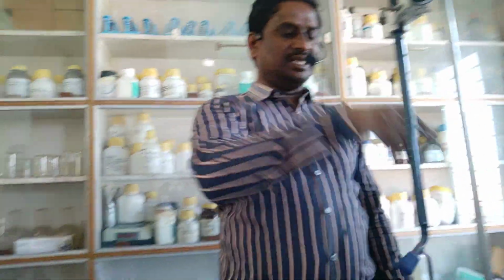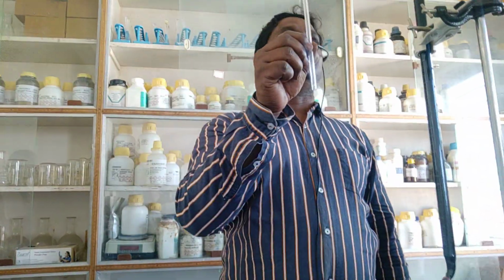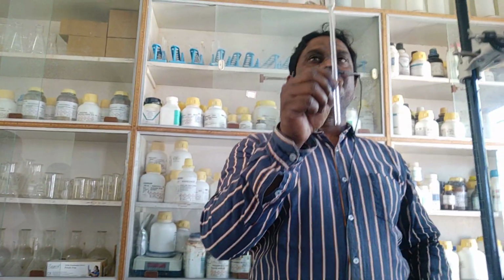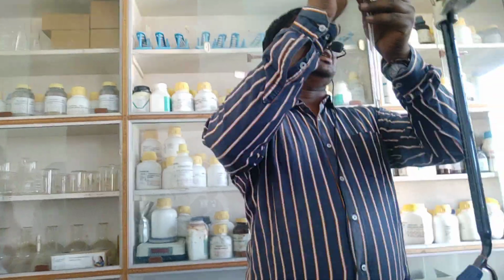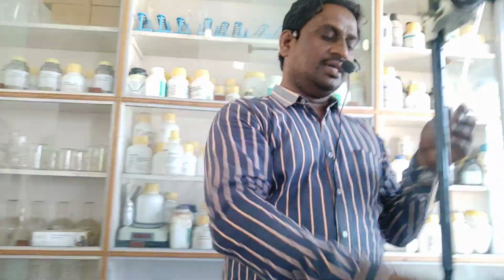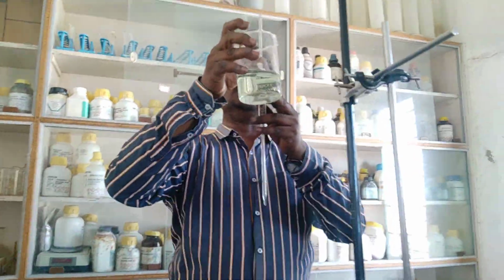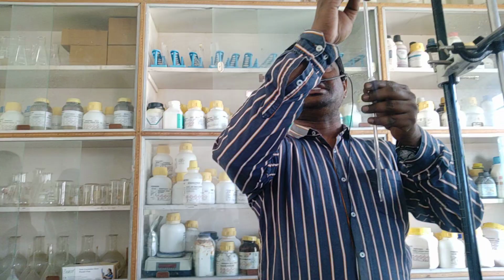If you release it fast, again you have to perform the experiment. While sucking the FAS solution, be careful to suck up to this mark only. Don't suck fast, it will go inside your mouth. In this, H2SO4 is already there. So don't suck very fast, suck slowly. Wash this upper layer neatly and then suck.